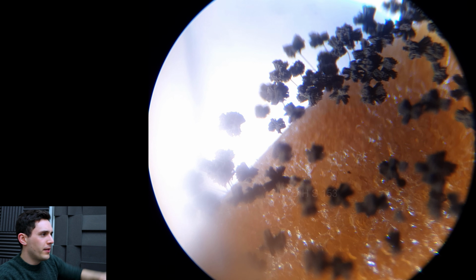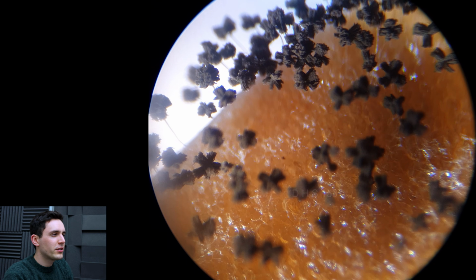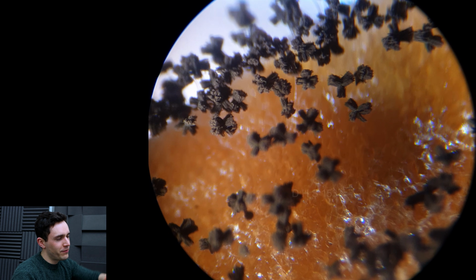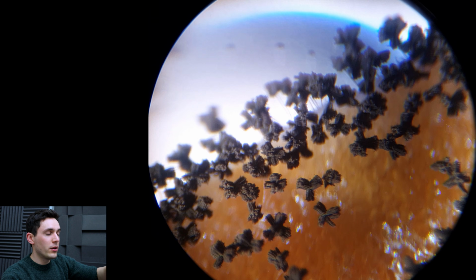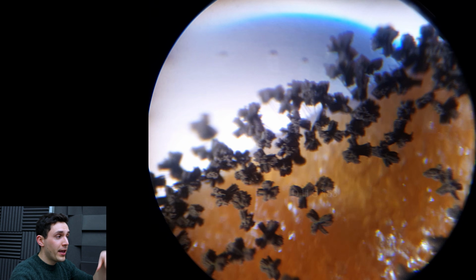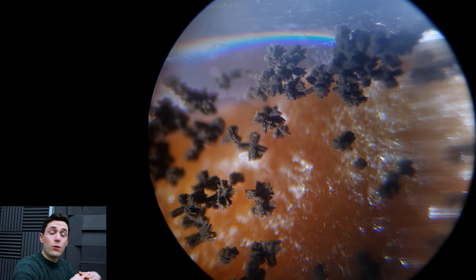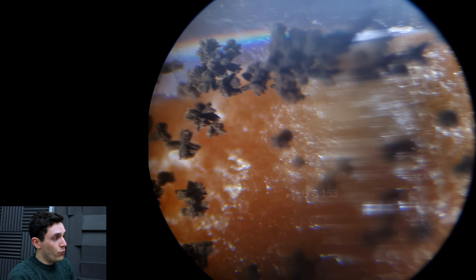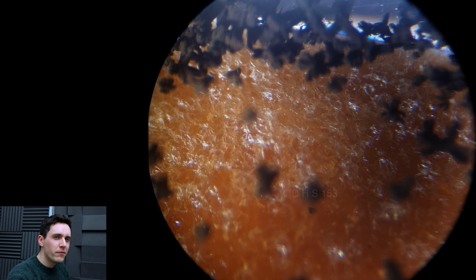But probably what you can't see, and I wish there was some way of doing it, maybe I'd have to soak the apple in lots of potassium hydroxide, is that woven right into the apple, there will be a very, very dense proliferative network of little hairs, and that's what we call the mycelium, which is the rooting, reproductive, feeding part of the fungus.